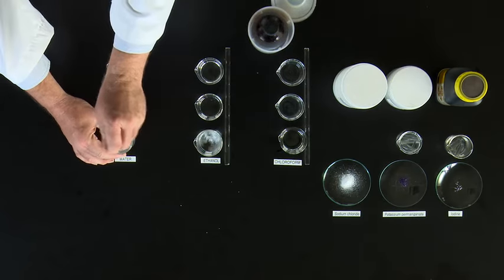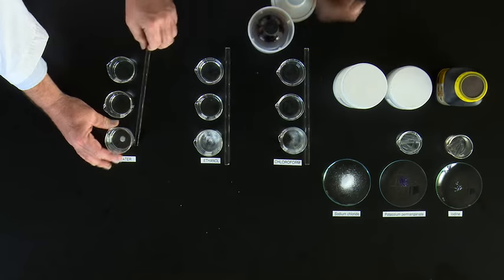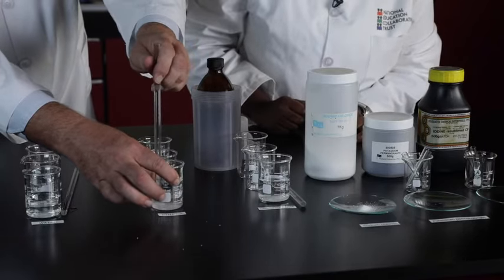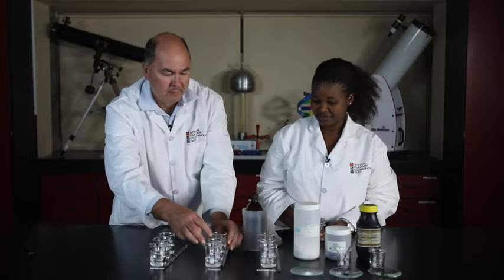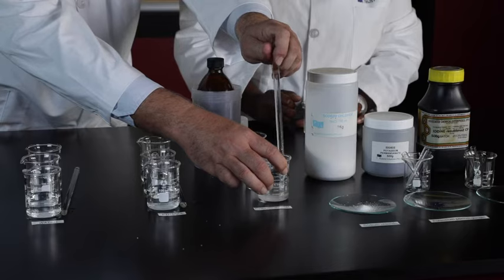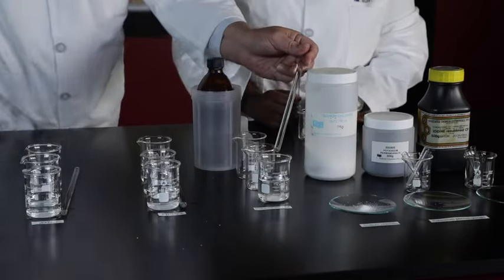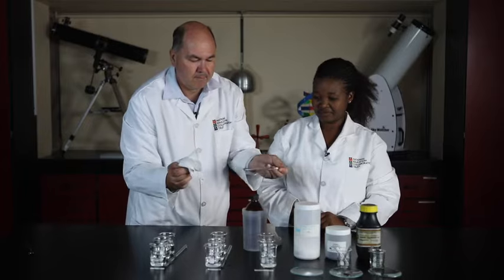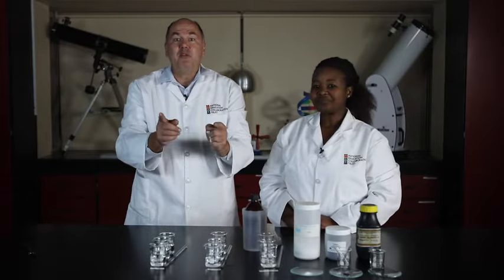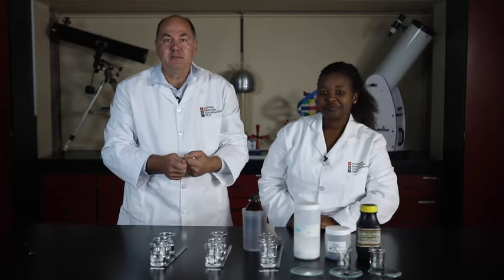I'll start to stir. 1, 2, 3, 4. Into the ethanol. 1, 2, 3, 4. The last one, the chloroform. 3, 4. I think that should do. And now we wait a couple of minutes for the solute to dissolve or to settle out of the mixture.